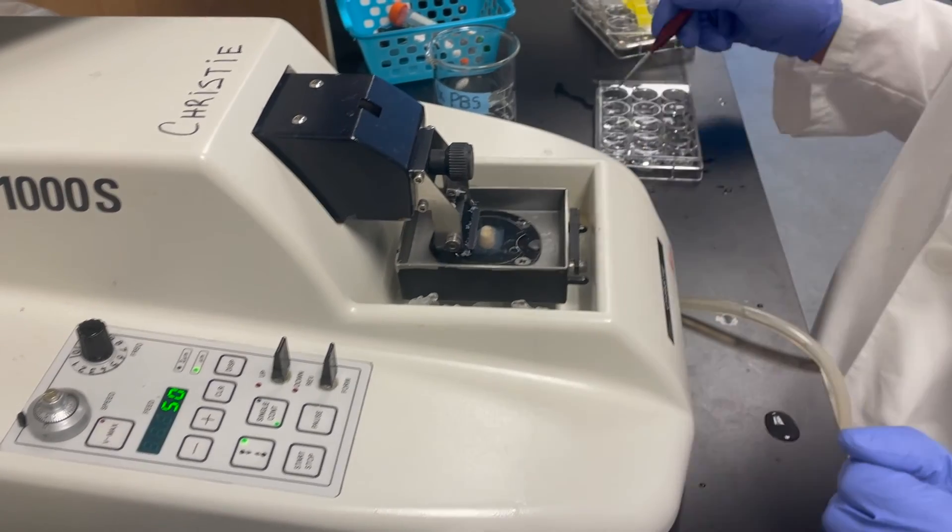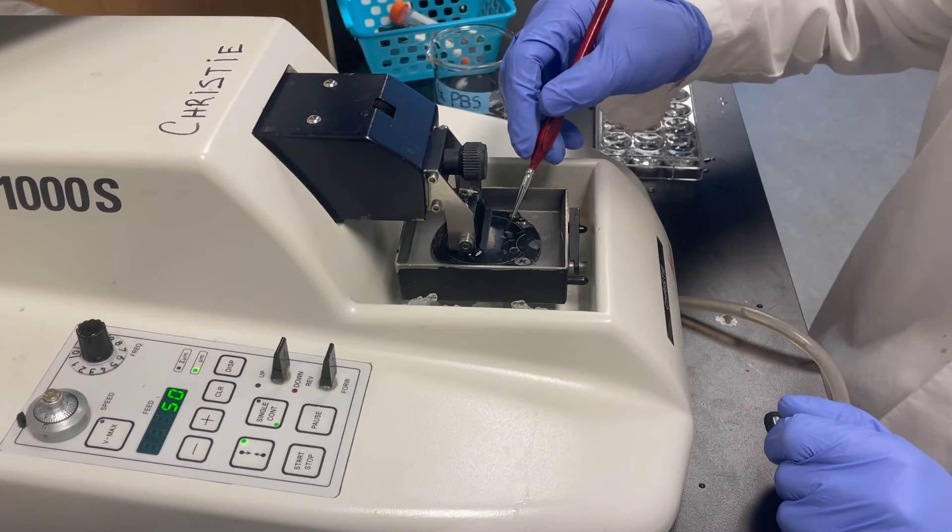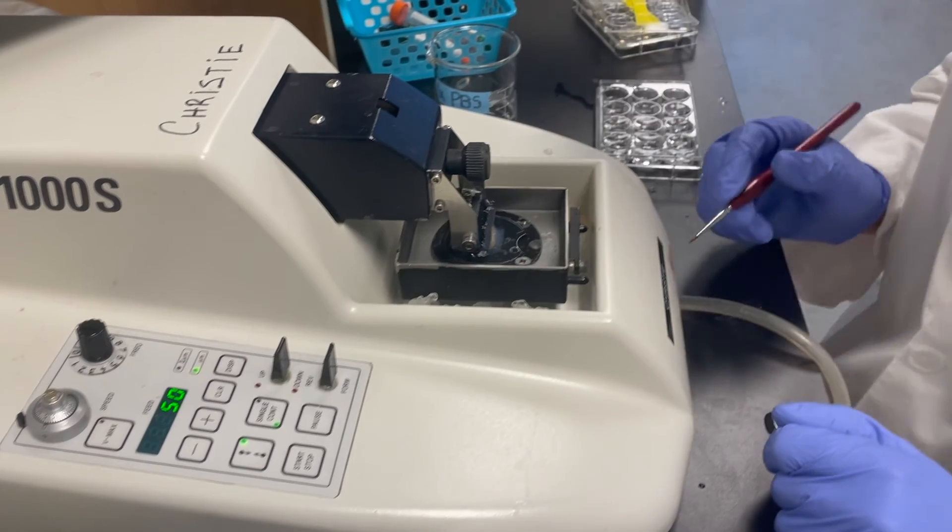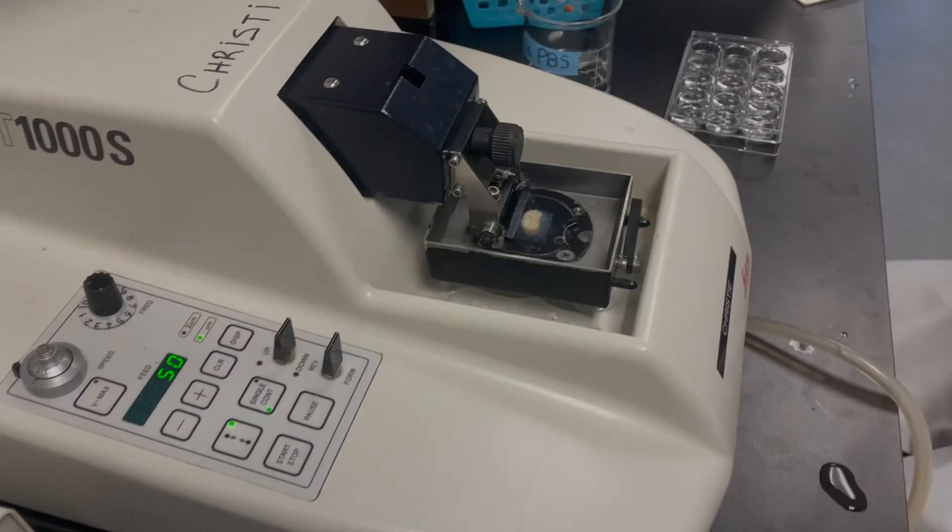To clarify, this is where we transfer slices one at a time in order from well 1, to well 2, to well 3, all the way until well 12, and then start over again. This way, each well contains an equal number of representative samples from throughout the brain.